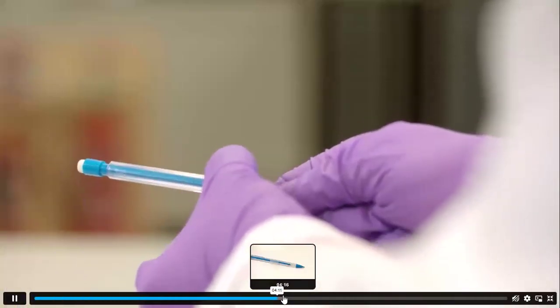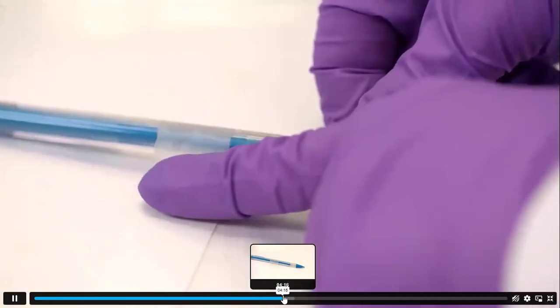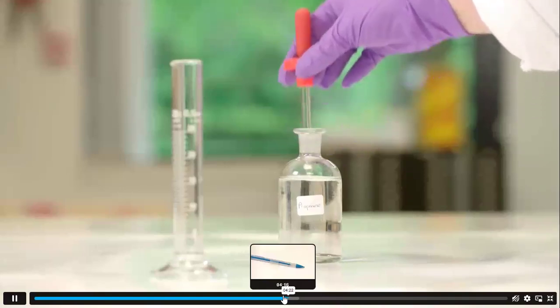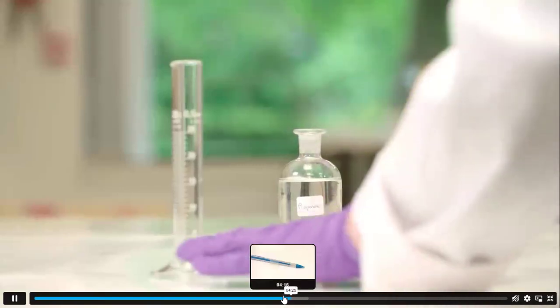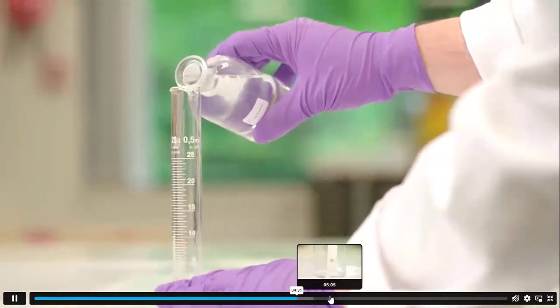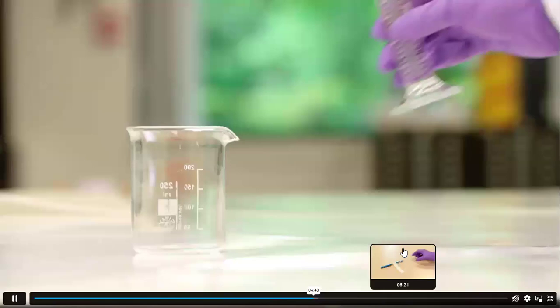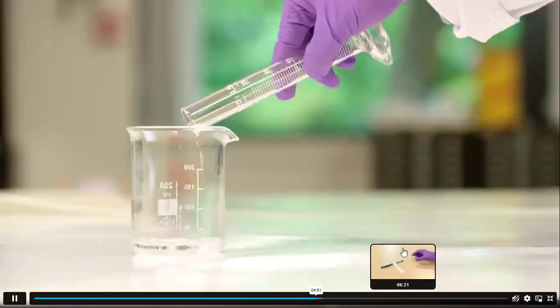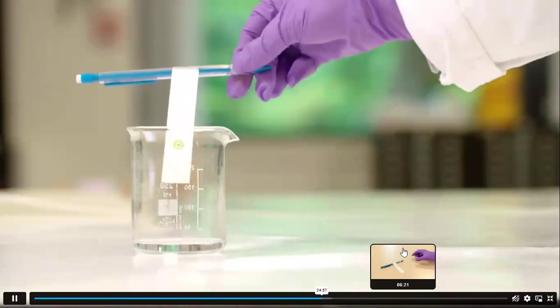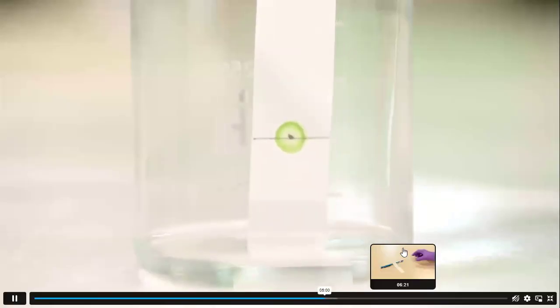Now they are going to have a chromatography paper. They'll attach it with a pin as we have done in the lab and they'll put it in a beaker. This is alcohol. Again, they are going to take alcohol and then they will put it in a beaker. Now we have to dip the paper into the beaker containing alcohol, but make sure that the dot should not dip in the liquid. Liquid will travel up.